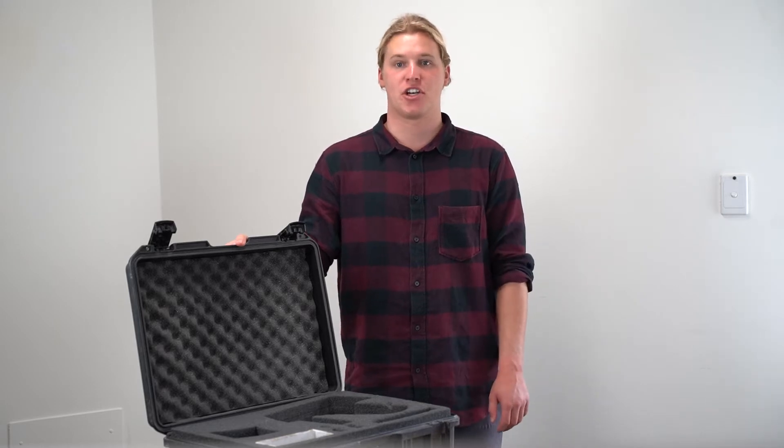Welcome back to Professor Spectrum. Today I'm going to show you how to pack up the NITON XL3T. Let's get started.